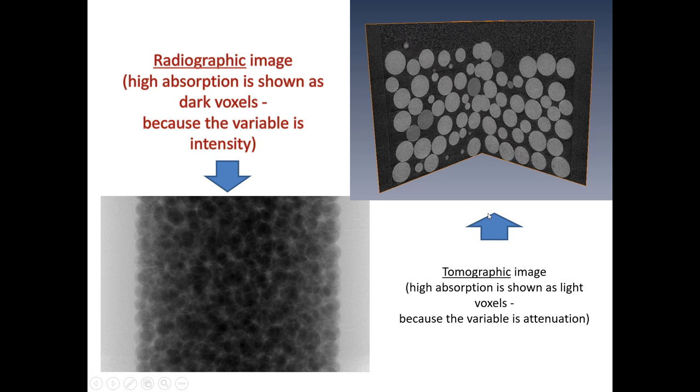And this is an actual reconstruction image. Whether I see my solid as dark or light is a matter of choice when you are mapping these numbers. You can always flip it to your liking. Sometimes it's the voids that will show as dark, and sometimes it's the solid. When I plot, personally, it's a matter of choice. I like showing solids as black and empty as void. But that's opposite of the actual spectrum, because empty is typically white, which is 255, a higher number, and dark is 0. So in that sense, it's a matter of agreement. We always make sure to say what it is that you label things with.